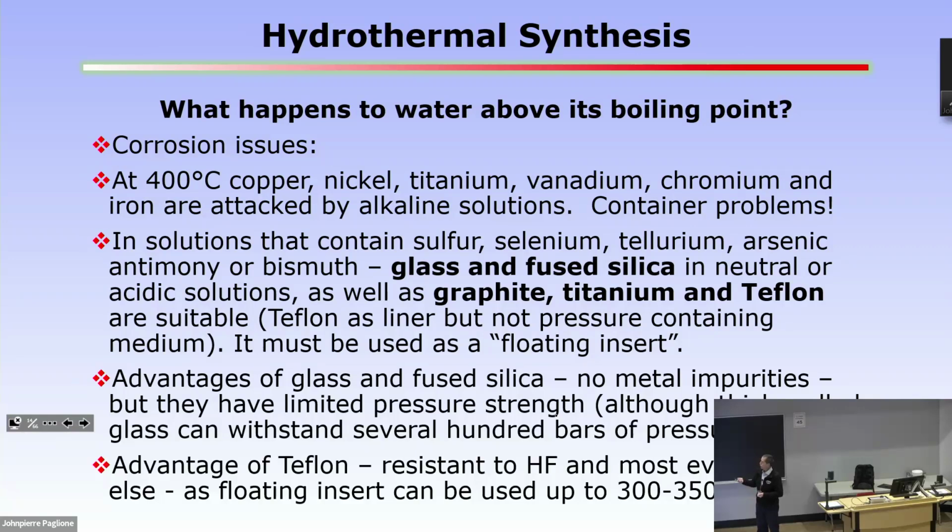There's an advantage to glass, fused silica. You don't get metal impurities, right? It's nice and clean. If you use a metal tube, there's always a chance that the metal from the tube will end up in your product.